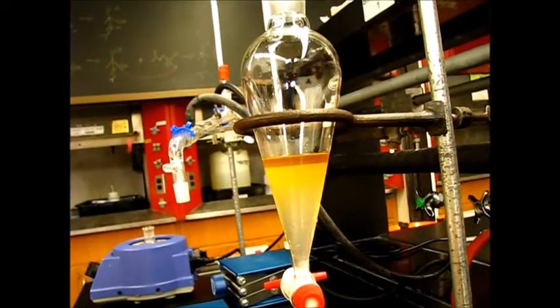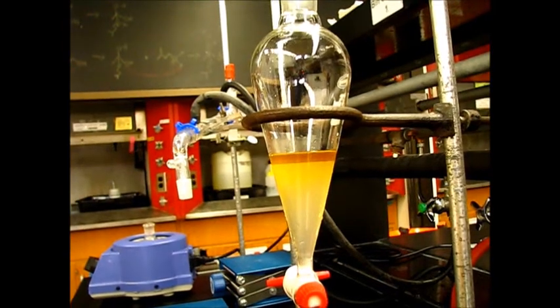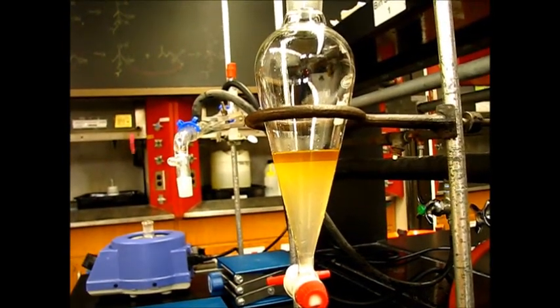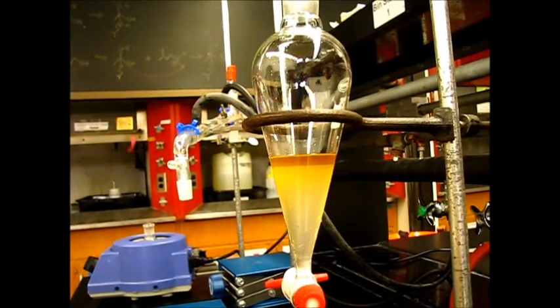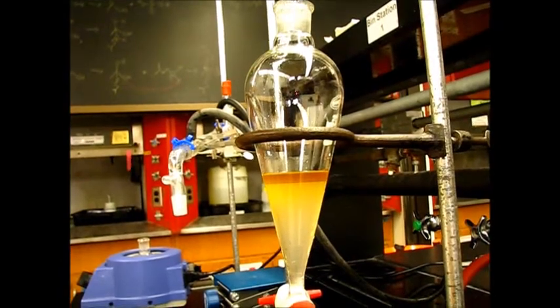Yeah, you can see it's still growing. Okay, so we'll remove the bottom layer and then wash once again with the sodium bicarbonate. And the top layer will remain here. Oh, now it's very clear. Yeah.